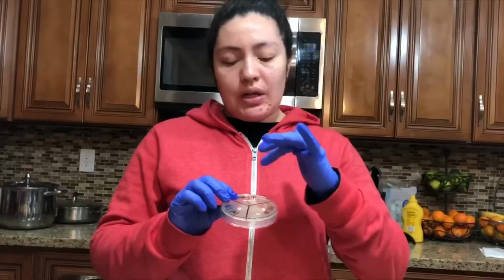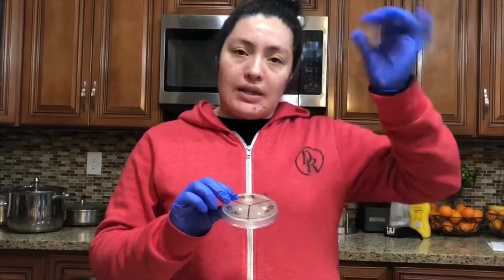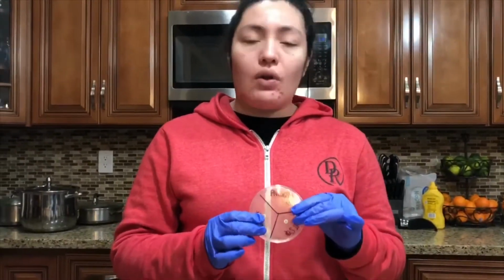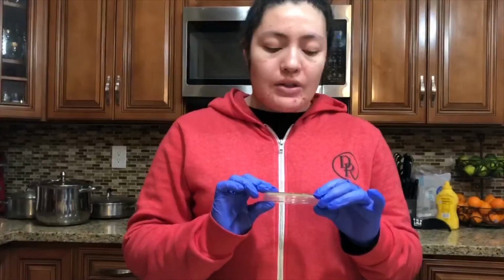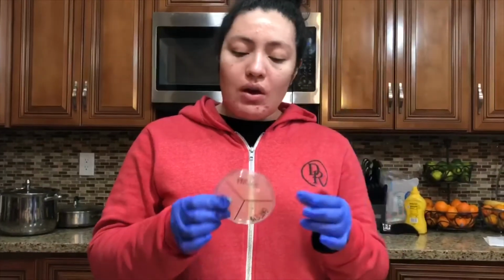So how I measured it, I got the 0 from the ruler, put it in the center of the disc, and measured until no bacterial growth ended, and it was a total of 12 millimeters. Penicillin came in second. It was actually a total of 10 millimeters, and then I had gentamicin, which was a total of 8 millimeters. So those are my results.